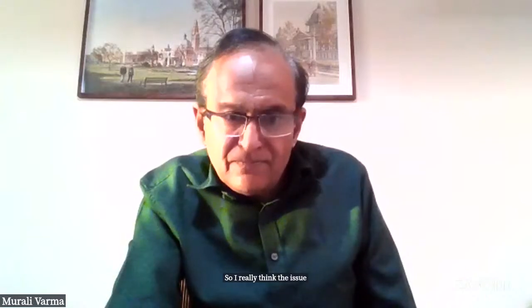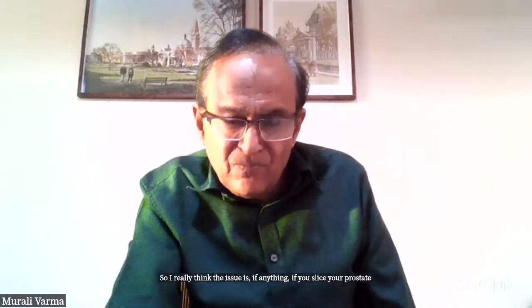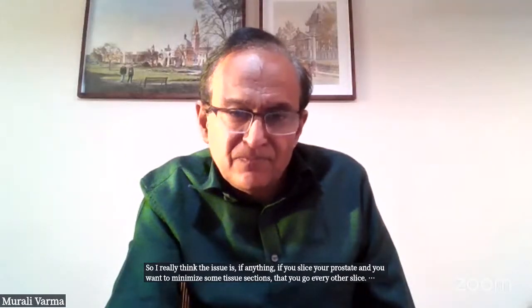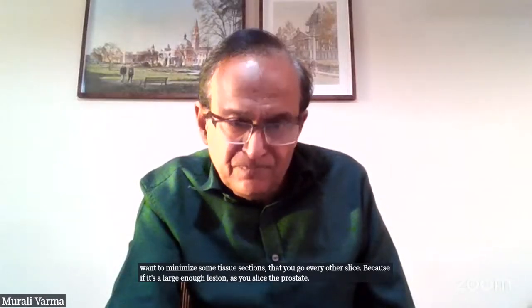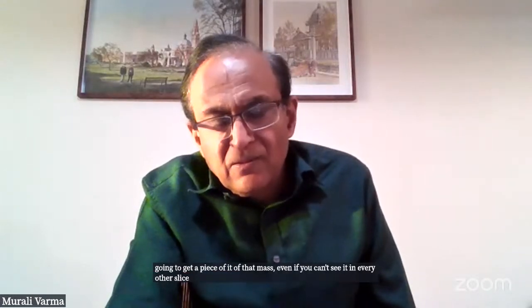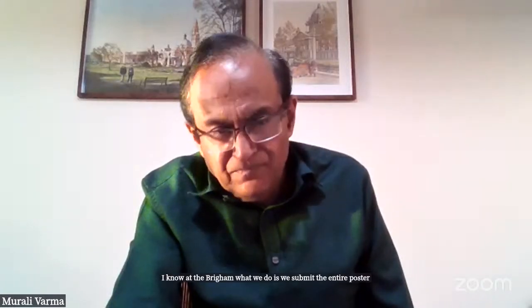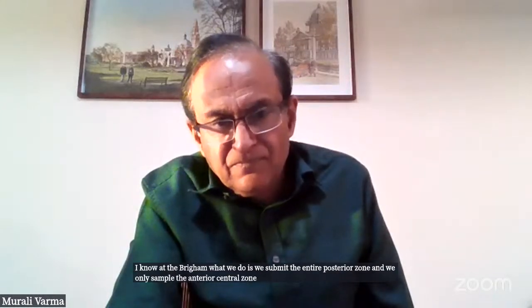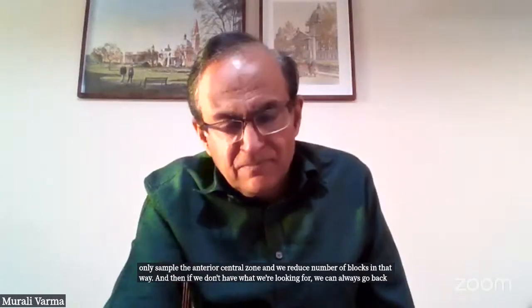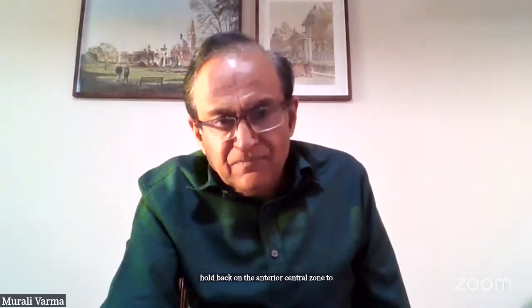So I really think a challenge. The issue is, if you slice your prostate and you want to minimize tissue sections, you go every other slice. Because if it's a large enough lesion, as you slice the prostate, hopefully you're going to get a piece of that mass, even if you can't see it in every slice. I know at the Brigham, what we do is we submit the entire posterior zone and we only sample the anterior central zone, and we reduce the number of blocks in that way. And then if we don't have what we're looking for, we can always go back. But we try to hold back on the anterior central zone to preserve some time and energy.